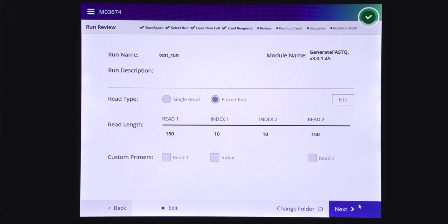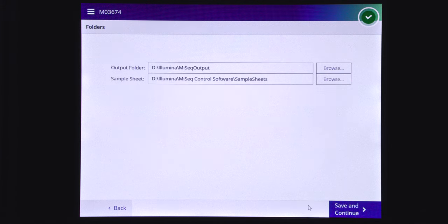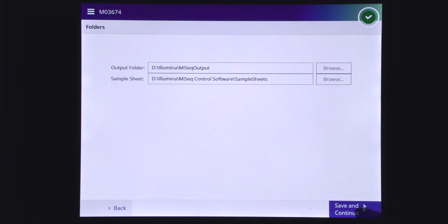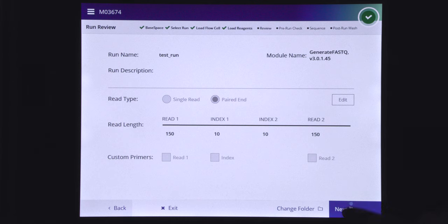When in Local Run Manager or manual mode, select Edit to make changes to read type, read length, or custom primers. Select Change Folder to review the folder locations. Modify if needed and then select Save and Continue. Select next.